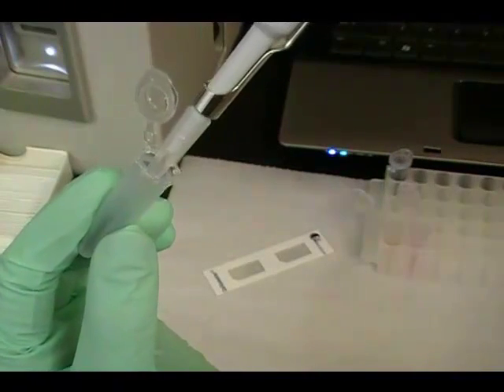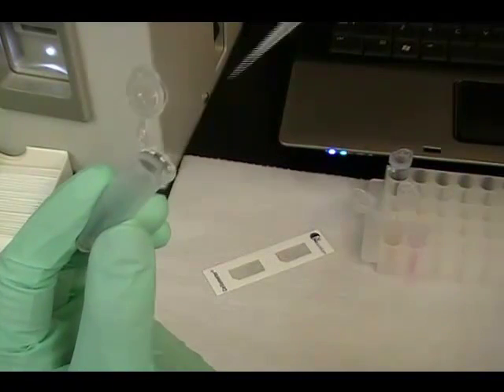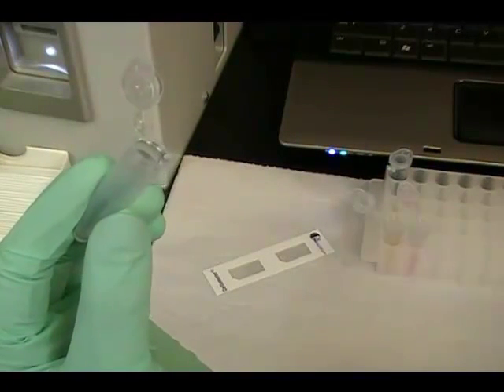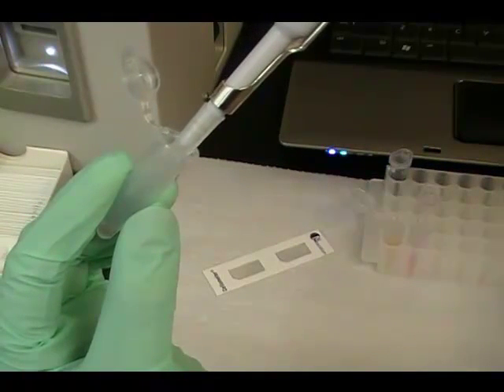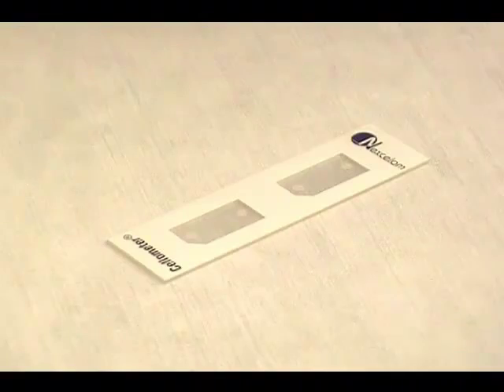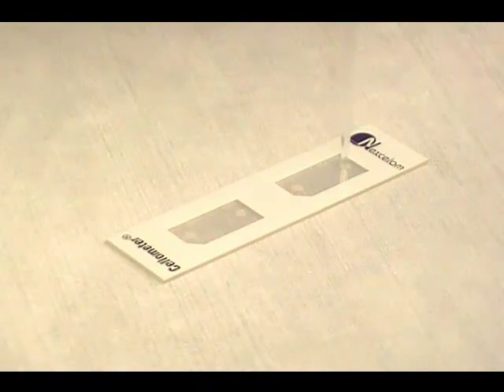For concentration and viability analysis, yeast cells are incubated with a propidium iodide staining solution. 20 microliters of sample is pipetted into a Cellometer counting chamber and allowed to settle for 5 minutes.